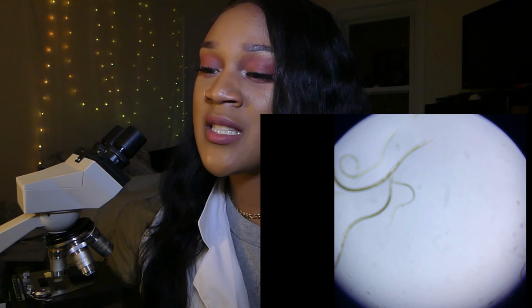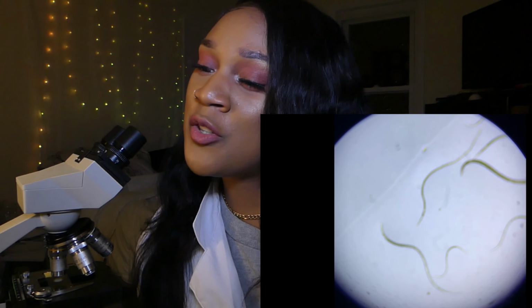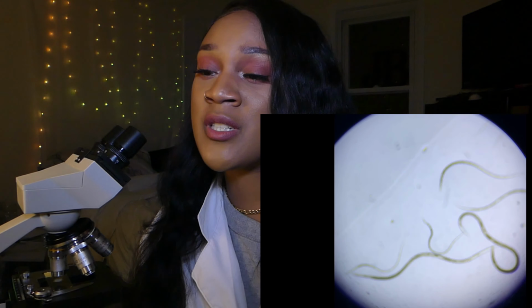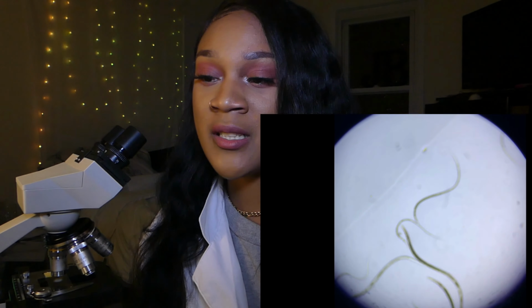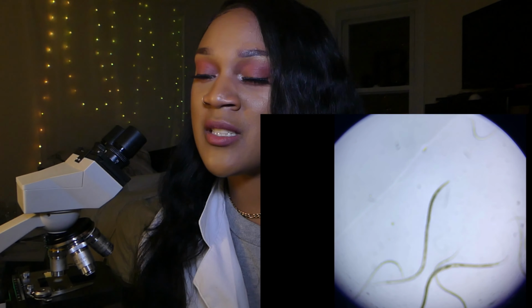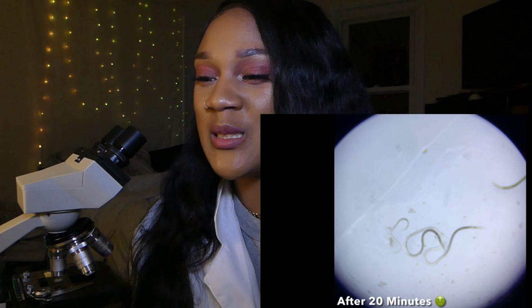After 8 minutes, they seem to be slowed down a little bit more, curling. They tended to move towards the edges of the droplet of where they came from. The medium size seems to be a little bit uncomfortable.